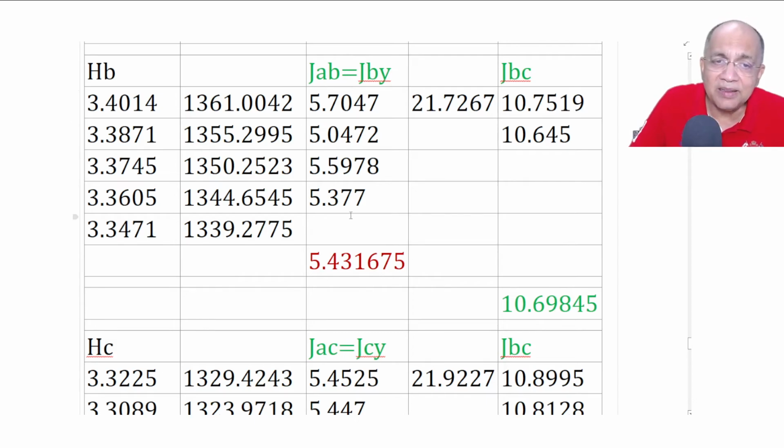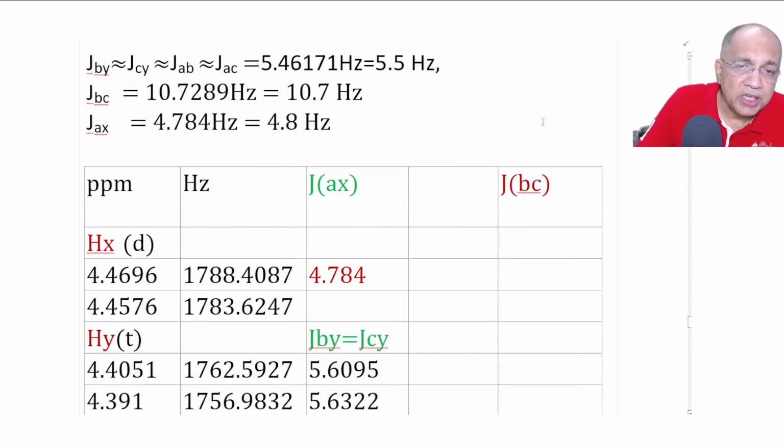But we have added all these four that we have found. It's 21.727, and they double up: this big J is equal to the sum of this. So to tally whether our calculation is correct or wrong, we have done this, but we have tactfully used it.